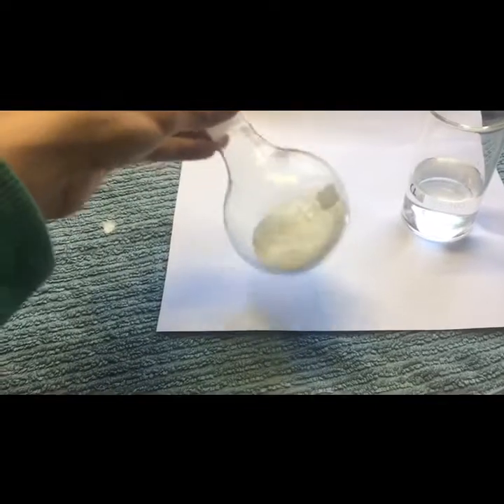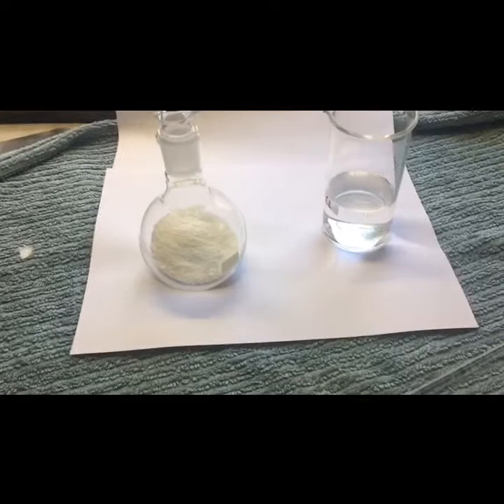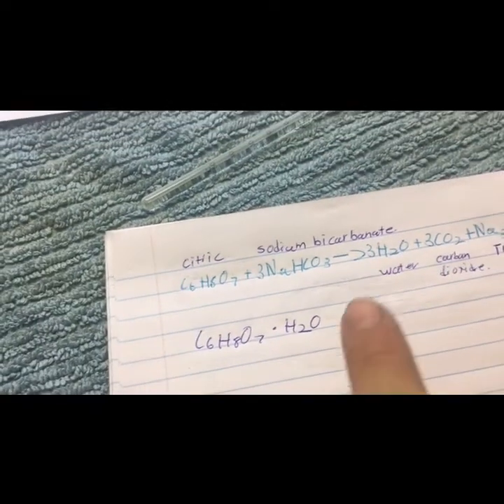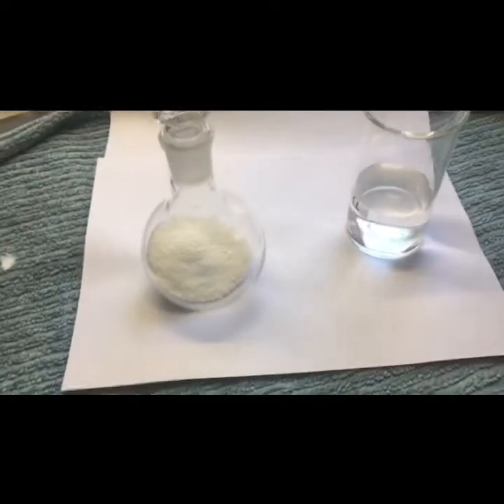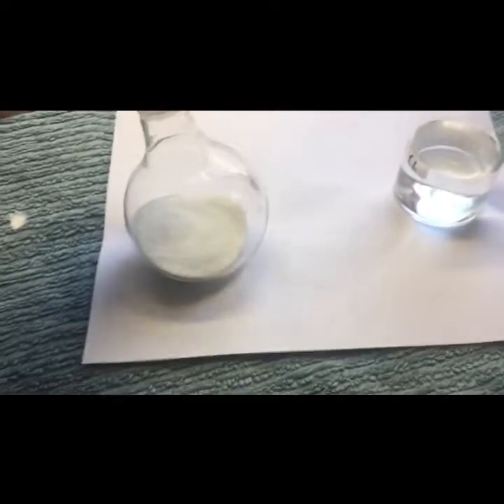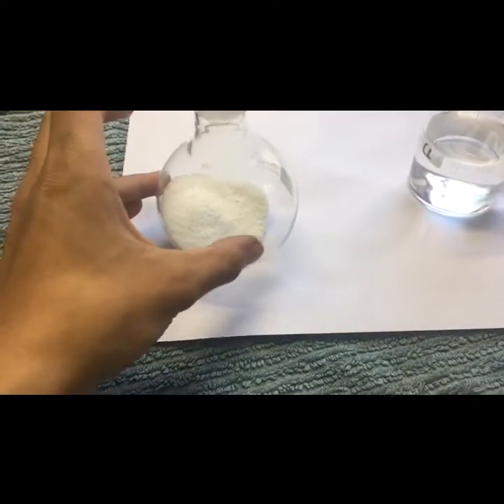I've mixed them in this round bottom flask. You don't need something that's fancy. You can use styrofoam cups if you want. And a little extra chemistry thing is that the citric acid you buy is normally monohydrate, which means it has one H2O molecule, or one water molecule, attached to it. So what does that mean? It means that in order to get this reaction going, you add a bit of water. Since the citric acid contains a bit of water, it should be reacting right now in this flask. In fact, the stopper just blew off here because of the pressure buildup inside.